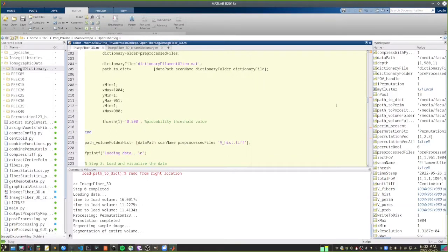The thing is, the tracking is better when you're slicing in the same direction as the fibers. If the fibers are vertical and the slices are horizontal, it finds a nice cross section for each fiber, and it can link them nicely. But if there's a fiber that's 90 degrees from this direction, in the plane, it's going to find a long cross section, and the tracking is really bad for that scenario.